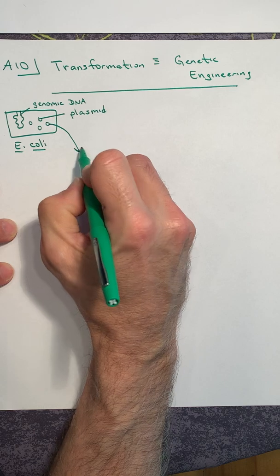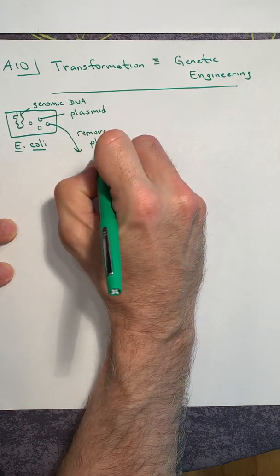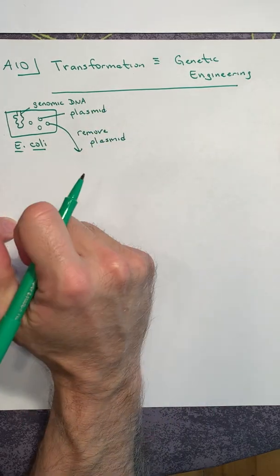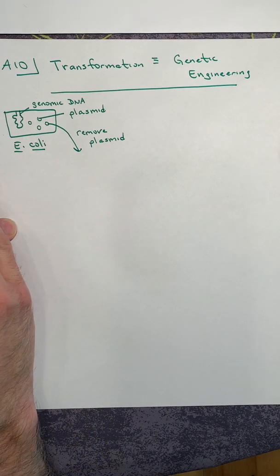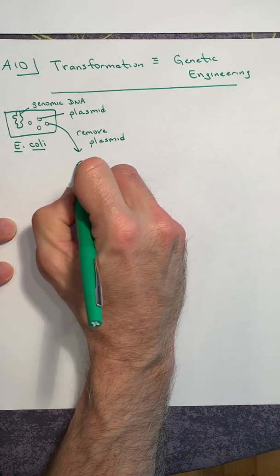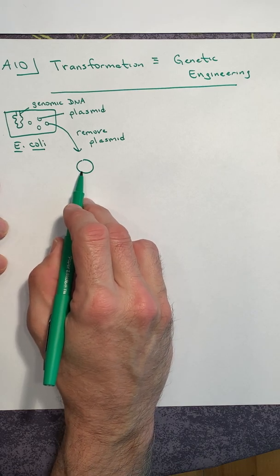So you can remove this plasmid. It's an easy protocol. So much of this biotech is so easy. If you have a thumb and you can do a micropipetter, you can do biotech. So you dissolve the plasma membrane, and then using a couple of filters, you can isolate the plasmid. So what you end up with is a bacterial plasmid. It's just a circle of DNA.